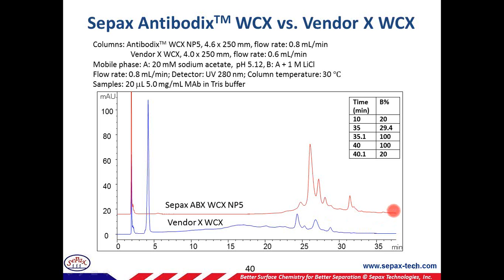So when you evaluate columns, do try a few rounds and optimize the conditions on all the columns you're going to screen. You're going to compare the best conditions for each of those columns, even with the same buffer system.